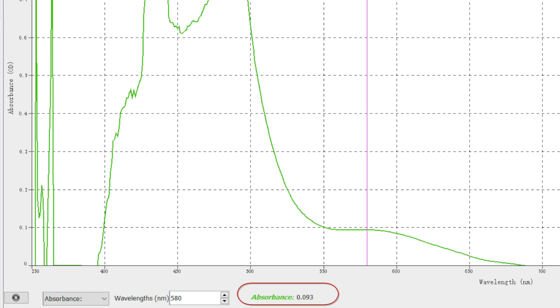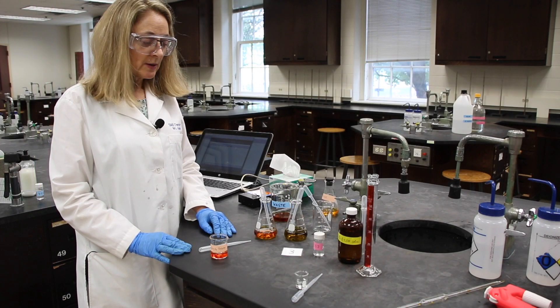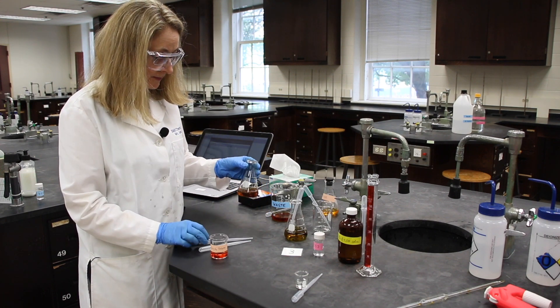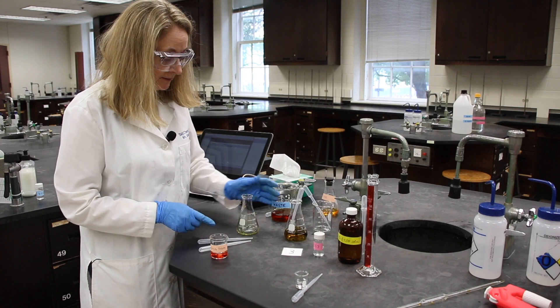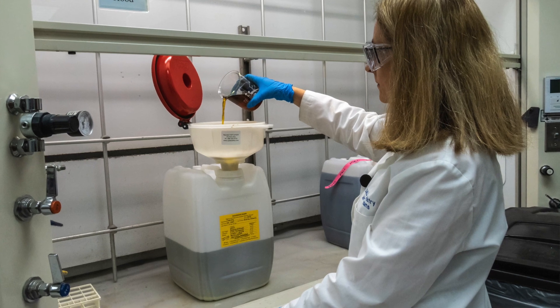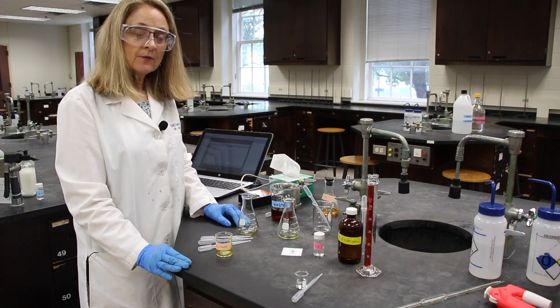This is the output from the spectrometer for our unknown — record the absorbance value in the red oval at the bottom of the graph in your datasheet. We're done with our experiment now. We are going to clean up anything that has contained the potassium dichromate solution, so definitely your unknown and your known need to be disposed of in waste. Then we'll transfer this waste to the hazardous waste carboy in the back hood and put all our equipment in the middle for the next group.